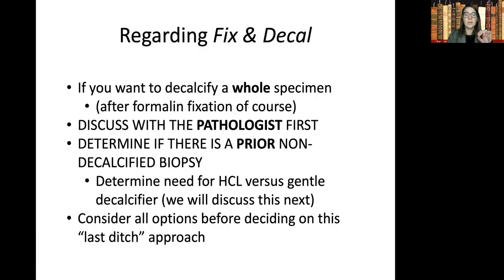So if you want to decalcify your whole specimen after formalin fixation, of course, please discuss with the pathologist first. Just determine if there is a prior non-decalcified biopsy, which may determine your ability to use either harsh HCl or a gentle decalcifier. Again, we will discuss this, don't worry. But consider all options first before deciding on this sort of last ditch approach, because it will require, as I said, decalcification of the entire thing.